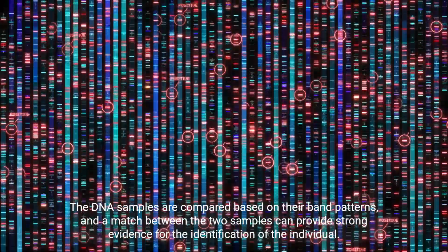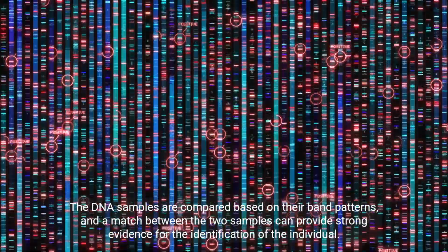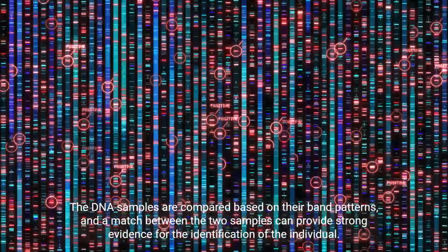The DNA samples are compared based on their band patterns, and a match between the two samples can provide strong evidence for the identification of the individual.